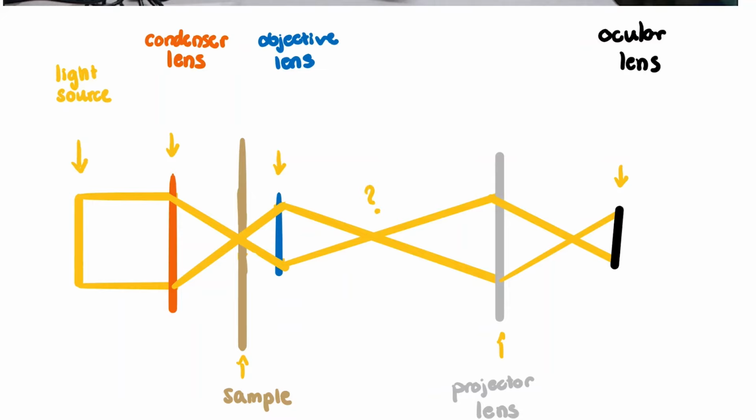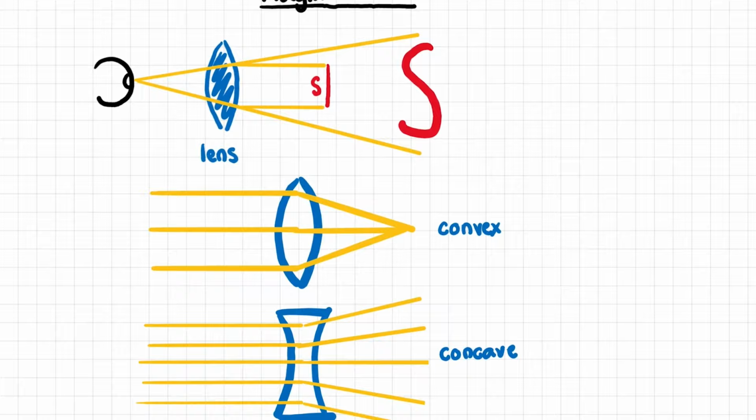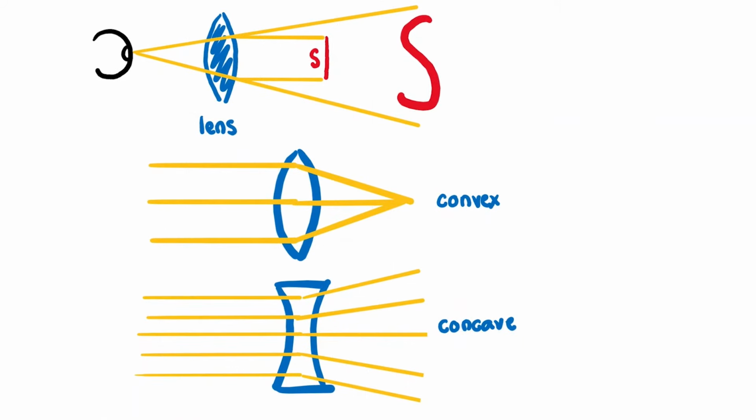Microscopes usually have a series of objective lenses, 3 to 4, and these vary in different magnifications, either from 4 times or 5 times, 10 times, sometimes 20 and 40 times, and as we go to higher magnifications, it may even be 100 times, although that may be more rare. And these different magnifications can be labeled as scanning, low, and high. To better understand how these objectives work, let's take a look at convex and concave lenses.